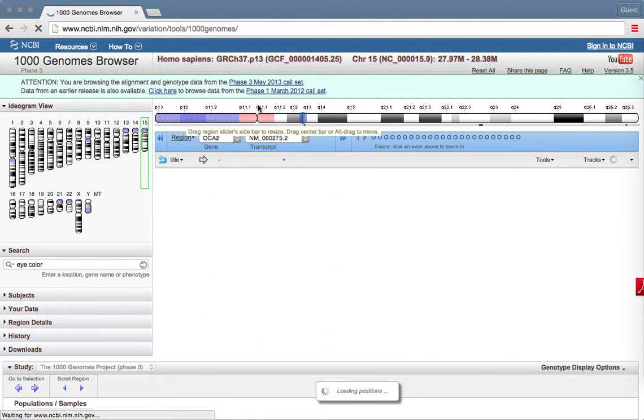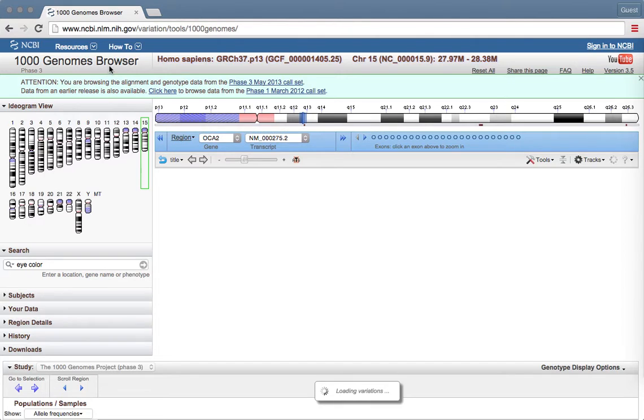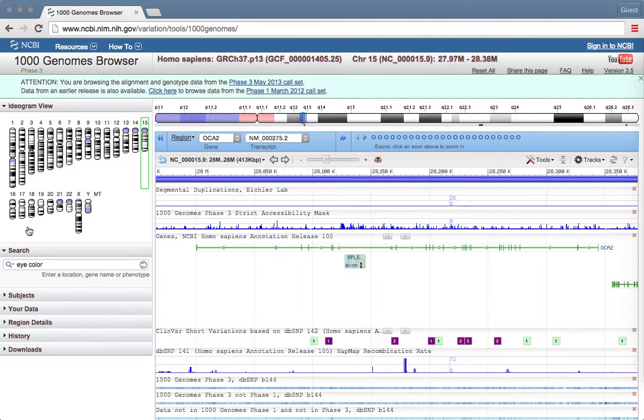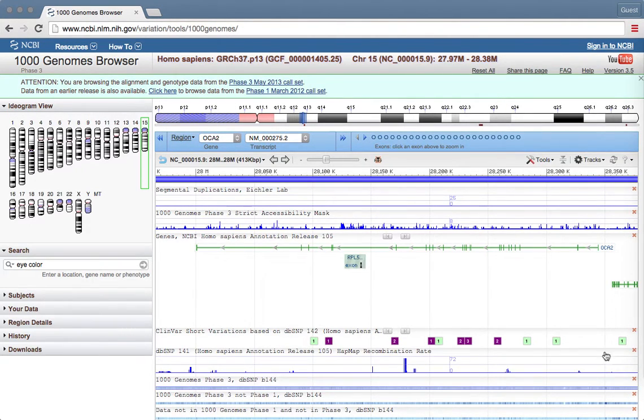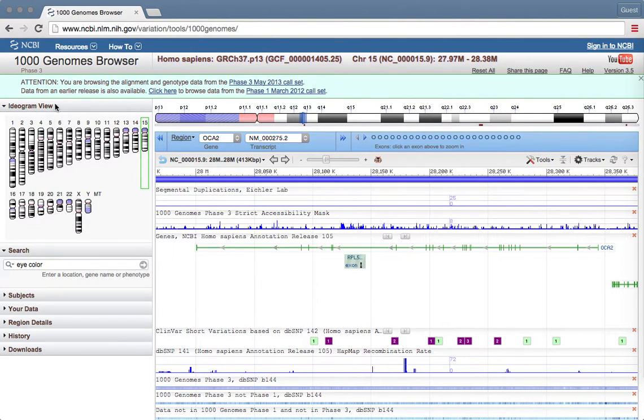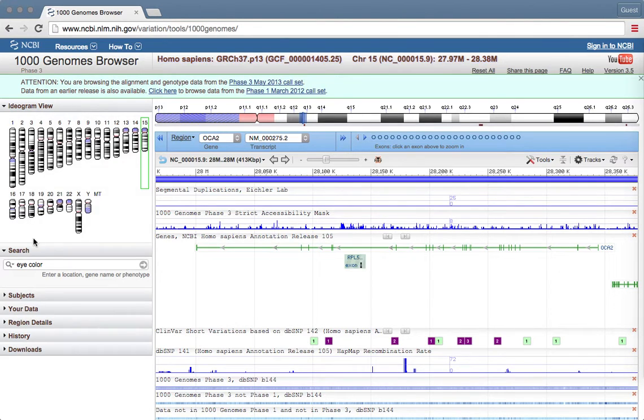When you click on that link, the page you get should look like this. There's a lot going on over here, but we're going to be primarily interested in these two boxes here, the ideogram view and the search function.